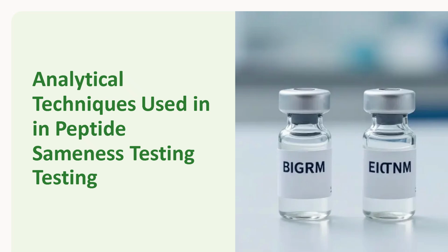In this video, we will explore the key analytical techniques scientists use to confirm peptide identity, structure, and purity. These techniques help pharmaceutical companies maintain high-quality standards and meet regulatory requirements during drug development and manufacturing.